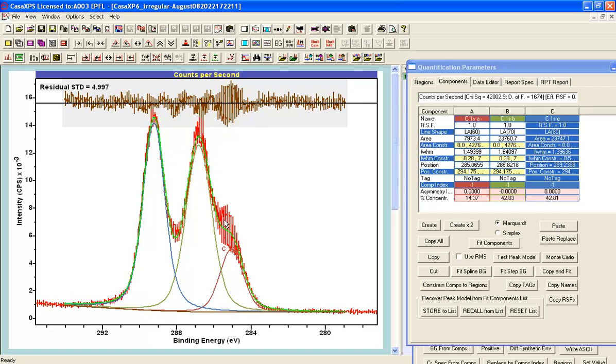For every spectrum that I had in the original file, I now have that many points for each data bin, and these are all being used to fit a curve in a least squares sense. So the 3 components we see here do not fit any particular spectrum in terms of intensity, but what they do provide is a uniform full width half maximum and position for each one of these components based on fitting to all the data simultaneously.